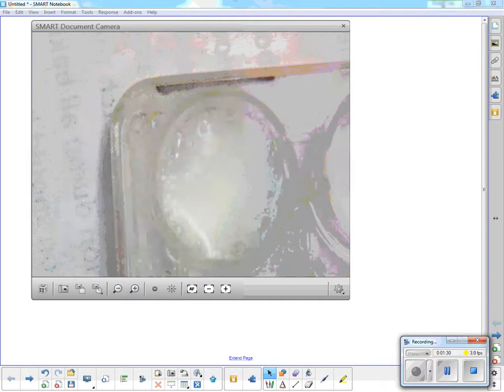Please don't breathe this because it's going to be really bad. Sometimes some of the hydrochloric acid comes up in it. But you're going to time it from the beginning, when you put the magnesium in, until it stops reacting. This is experiment A. You are going to choose what experiment you do to test concentration, what one you do to do temperature, and what one you do to do particle size.